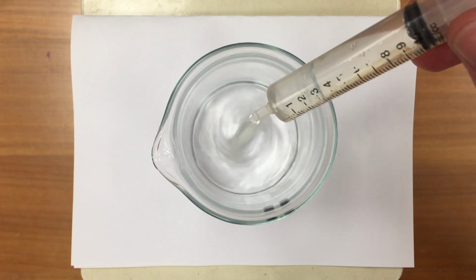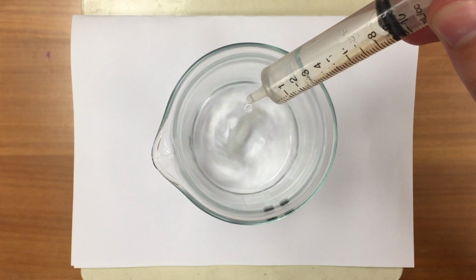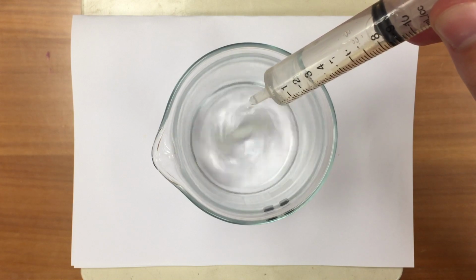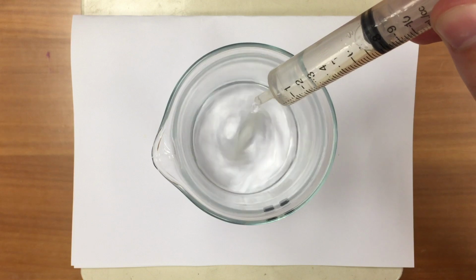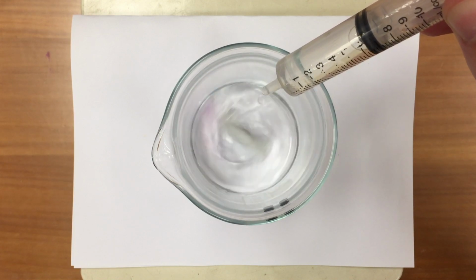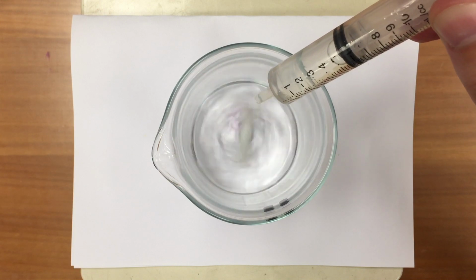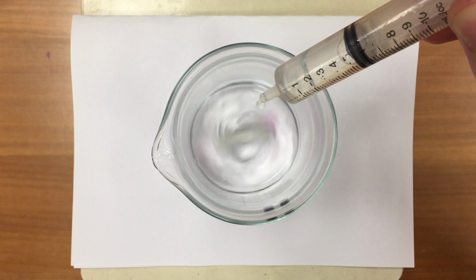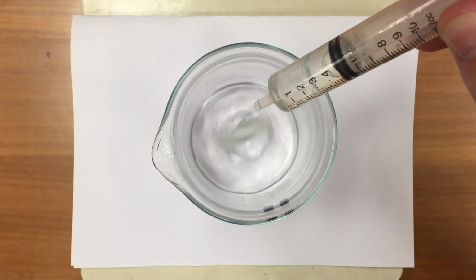I've taken another 10 mil sample, going drop by drop. You can see there's a pink colour that's there temporarily and then it fades away. I'm looking for a first permanent pink colour. So I'm going to slow down my dropping rate.